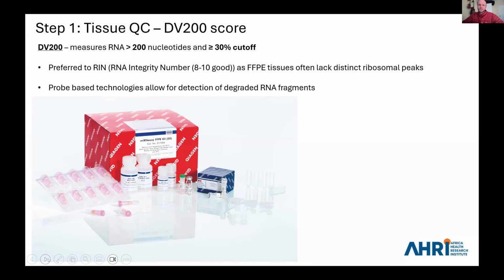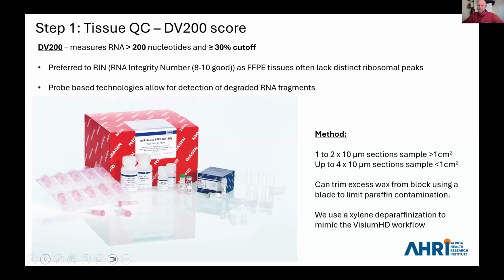Because the Visium HD is a probe-based technology, it allows for detection of degraded RNA fragments. So in this case, you're not looking at the RIN score, but you're looking at the DV200 score, so measuring fragmented RNA.